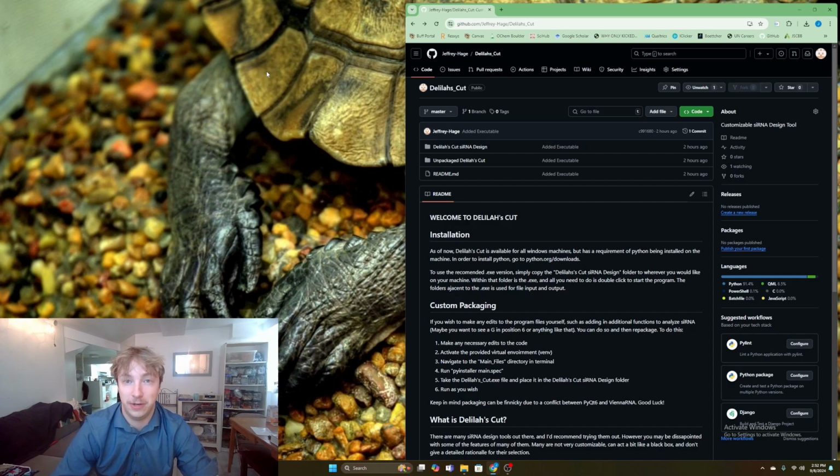Now, if you're watching this video, I'm sure you're pretty familiar with siRNA and what exactly it can do and why it's so great. But having that targeted knockdown of mRNA can be incredibly powerful, especially for in vitro research and looking at, knocking down this protein. How can this affect that? It's pretty good at having minimal off-target effects.